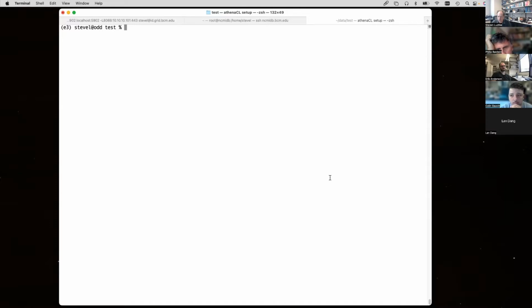But if it's something you're just doing a couple of times, you can just do it from Python and it'll be fine. Okay.